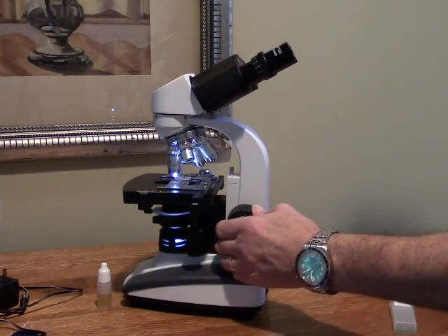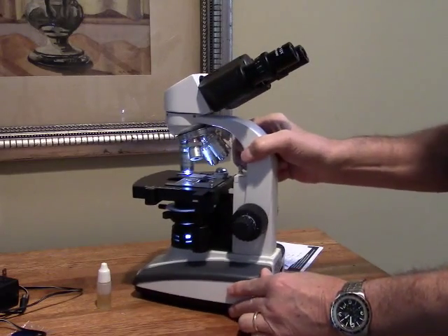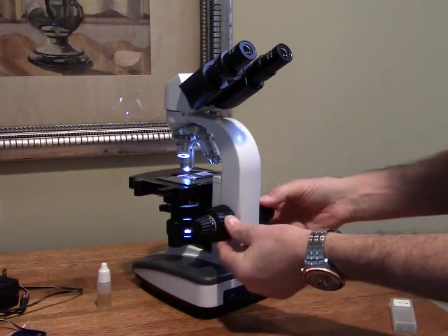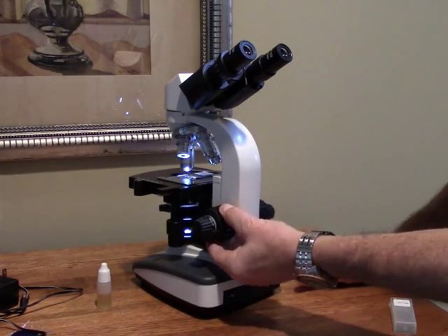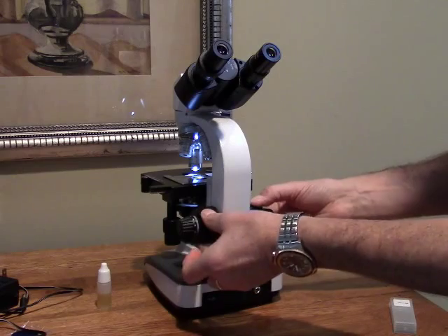It's a very nice overall microscope. This is the coarse adjustment and this is the fine adjustment — this is what is called coaxial because both knobs are on one shaft. Both the coarse and fine adjustments are available on each side for left- or right-handed users, which is really convenient.